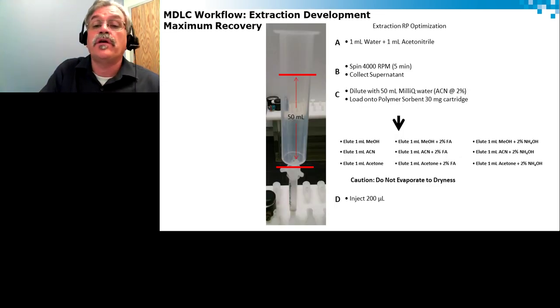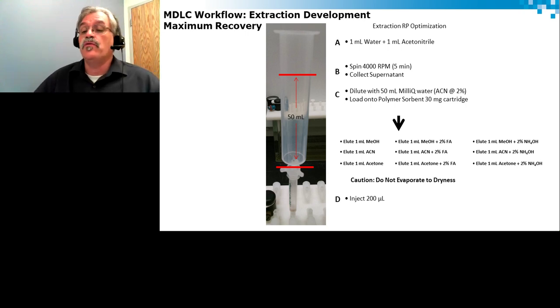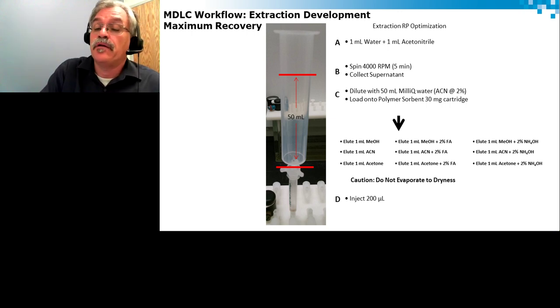Now, in this case, in the aspect of extraction development for maximum recovery, since I do not need to evaporate to dryness ever again, I can now spend some time on the optimization and look at the polarity of my solvent, but also at my pH, and find on a quick experiment which method, which condition will give the best recovery.